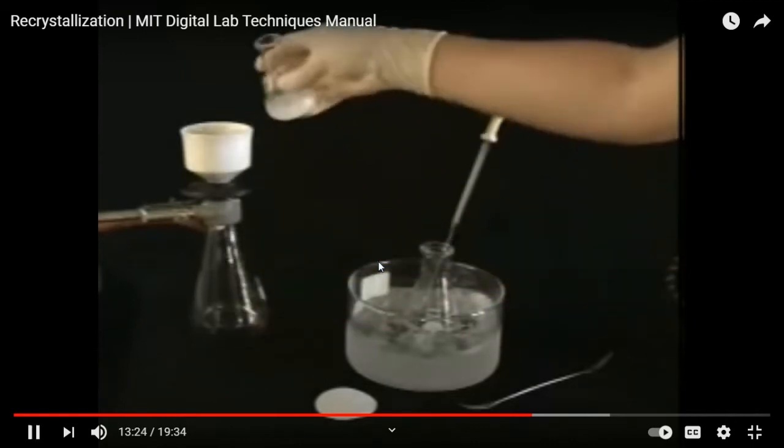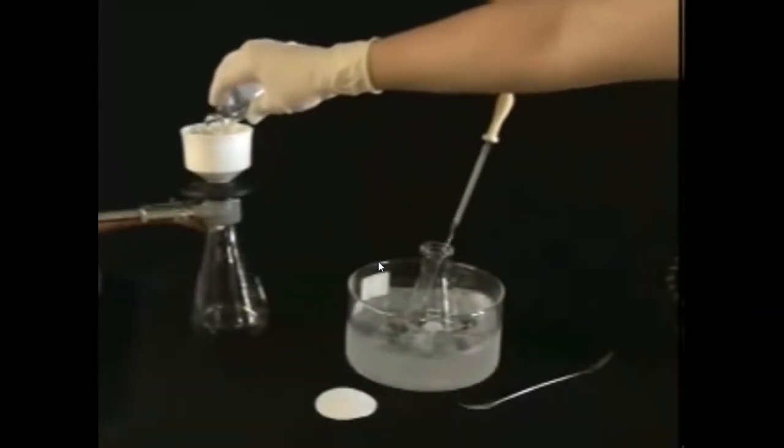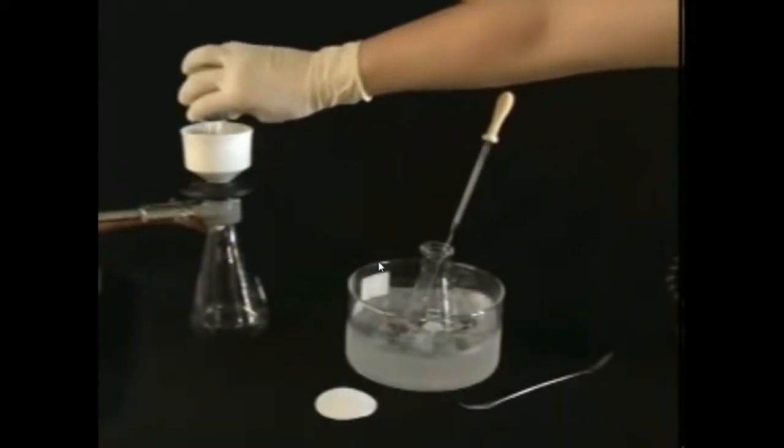Pour the crystals and the mother liquor onto the funnel, using cold solvent to transfer all of the crystals from the flask.